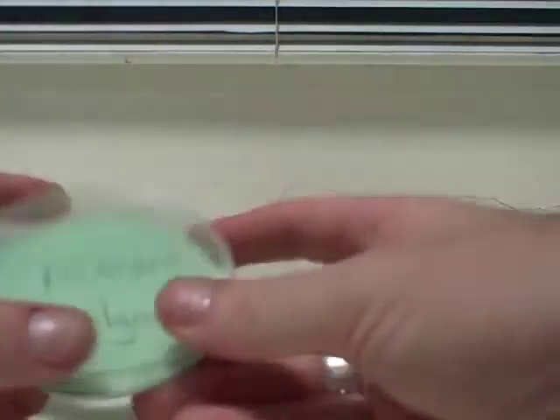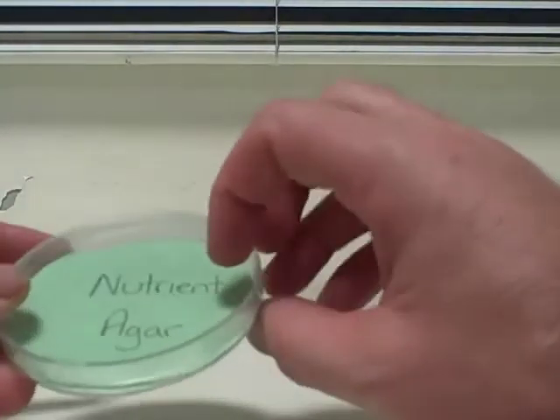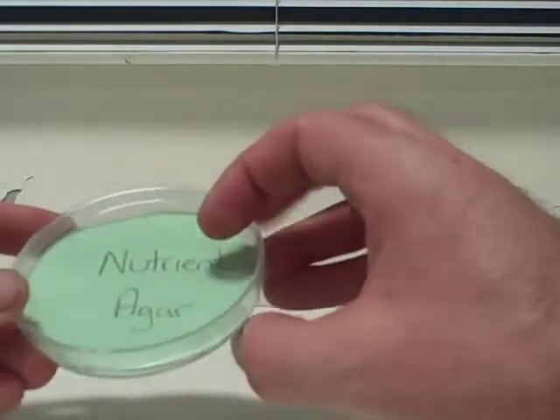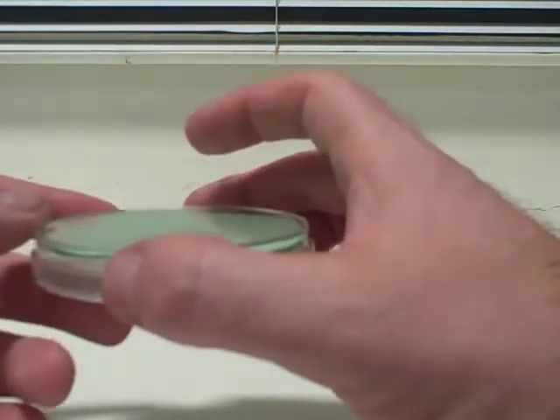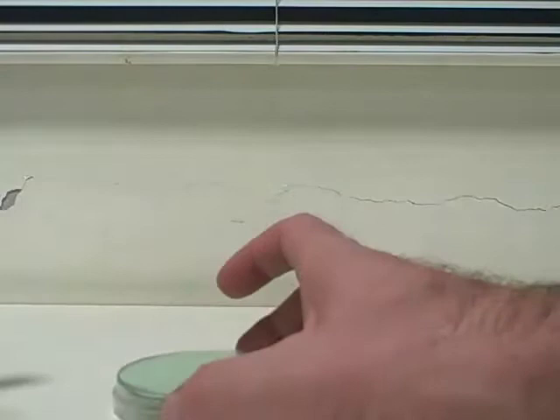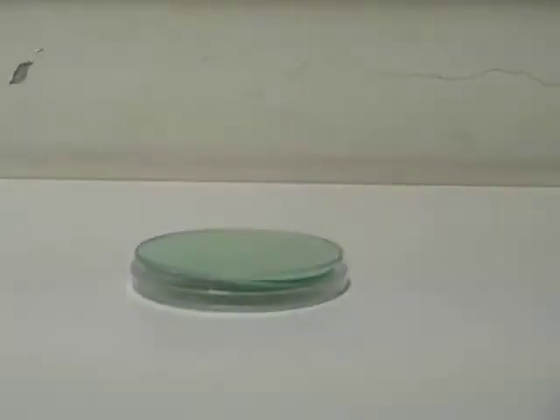End result, nutrient agar, food for the bacteria that's moist, bacteria colonies in four areas, though we don't know what's growing, can't see anything yet, and it's sealed. The last thing is you turn it upside down, jelly side up, and leave it where you're asked to for a few days for your bacteria culture to grow.